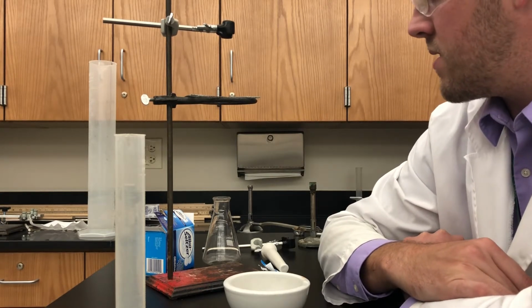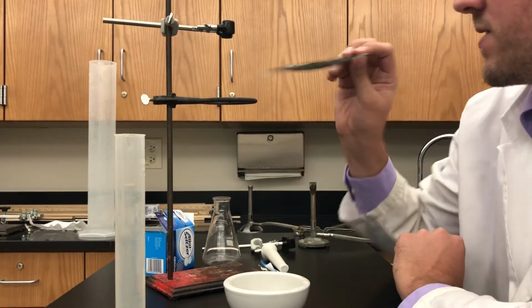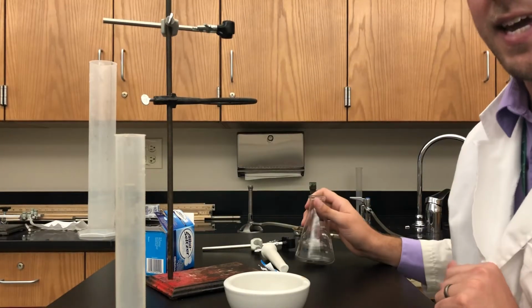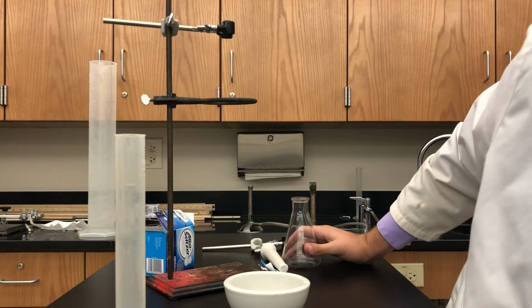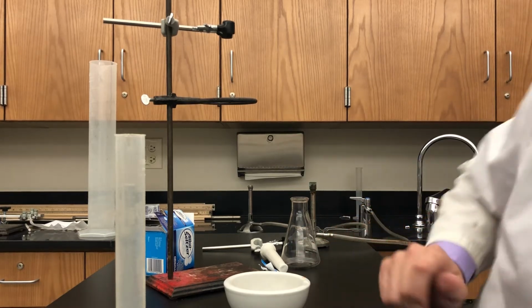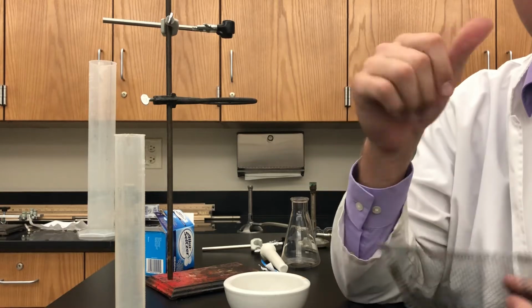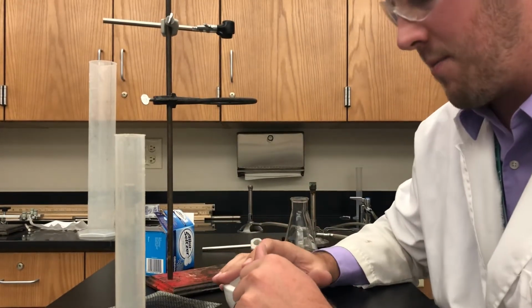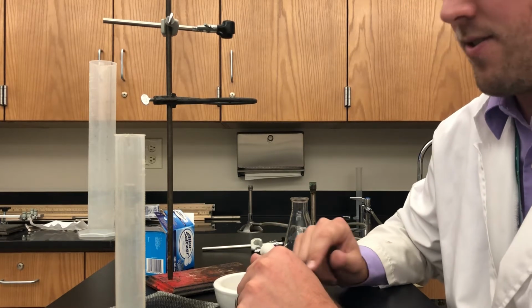Another safety concern, by the way, I have burned myself on these wire meshes before. This is to help support the Erlenmeyer flask. You get a really cool little pattern on your thumb or on your finger. Maybe you don't want to find out firsthand, but it'll burn this little waffle kind of thing on your thumb. Like I said, I have done that. I probably have made most of the mistakes that I'm going to warn you about in class this year, and hopefully you can learn vicariously through me.